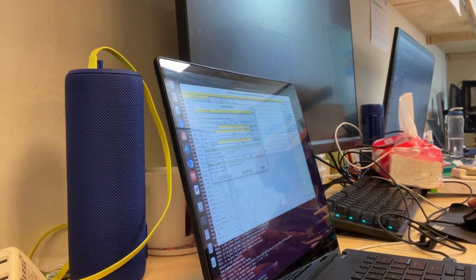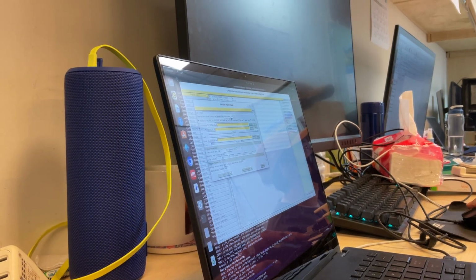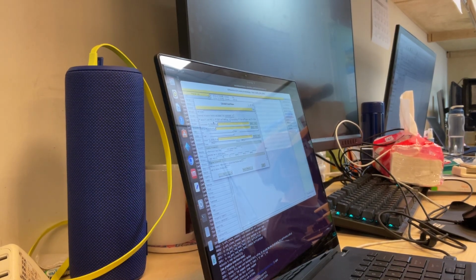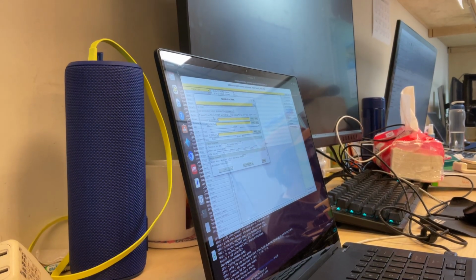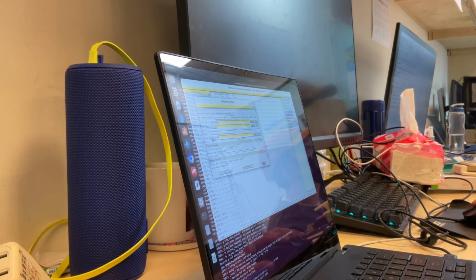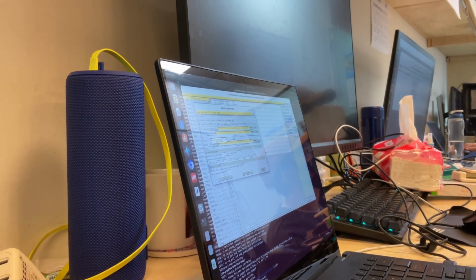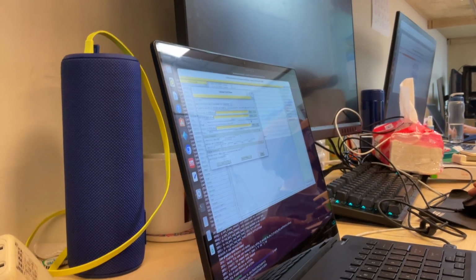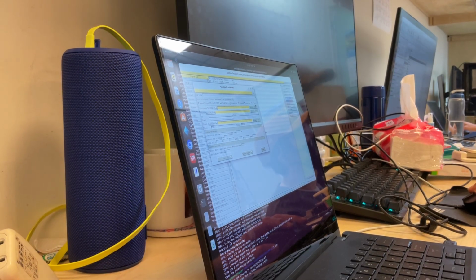So SFO will take, see, you generate structure factors and phases from coordinates. Exactly. And then append FC and PHIC. FC and PHIC mean calculated structure factors. Remember, FO is observed, FC is calculated, and PHIC is calculated phase. Okay, cool. To FP and SIGFP. FP is observed. I don't know why in CCP4 they don't use FO, they use FP. FP and SIGFP are the experimental ones from the existing MTZ file, and scale input FP to FCalc.